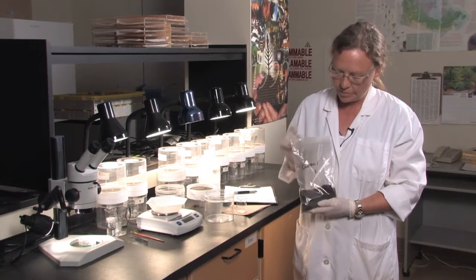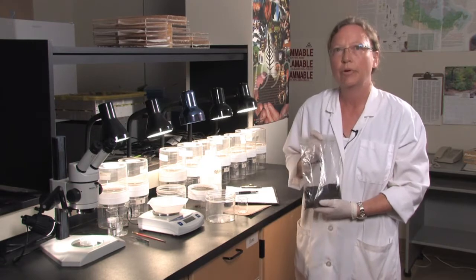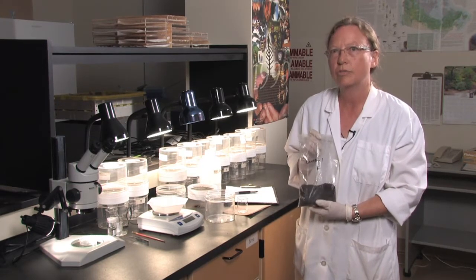We have received the STEMS soil sample from the field, properly labeled, and now we're going to run a microarthropod extraction on it.